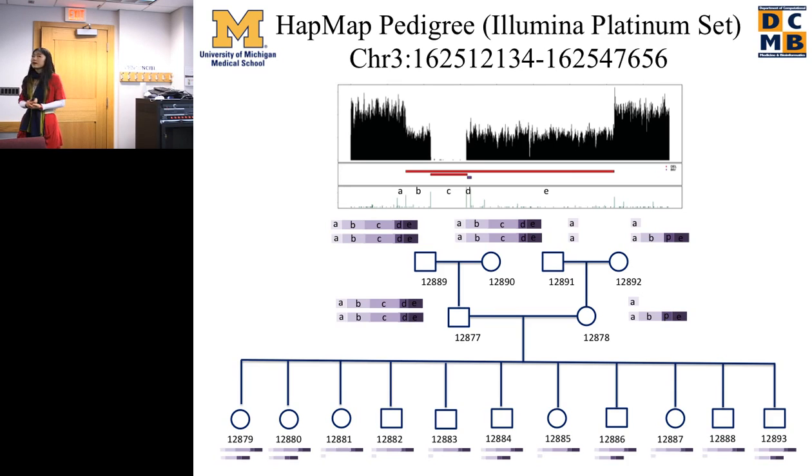Also, in defining the breakpoint, we didn't consider the coverage. If there is a very strict coverage change, it could also indicate a breakpoint. But adding the coverage and read depth calculation is going to take the 2-hour run to 2 days, so we got rid of that, and we sacrifice a very small proportion of the breakpoints we can define.